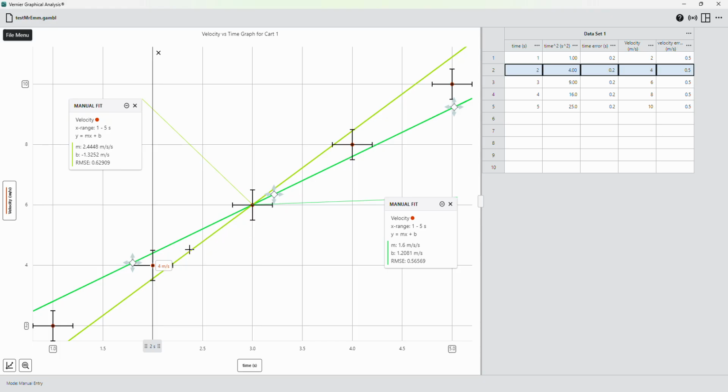So as I said, this box and this box allow you to change the slope up and down, and the middle one allows you to move the line up and down until you find the best possible spot. And even the examiners are not going to measure anything. They will simply look by eye and see if that makes sense or not, if you fall within the right geometrical areas, let's say.